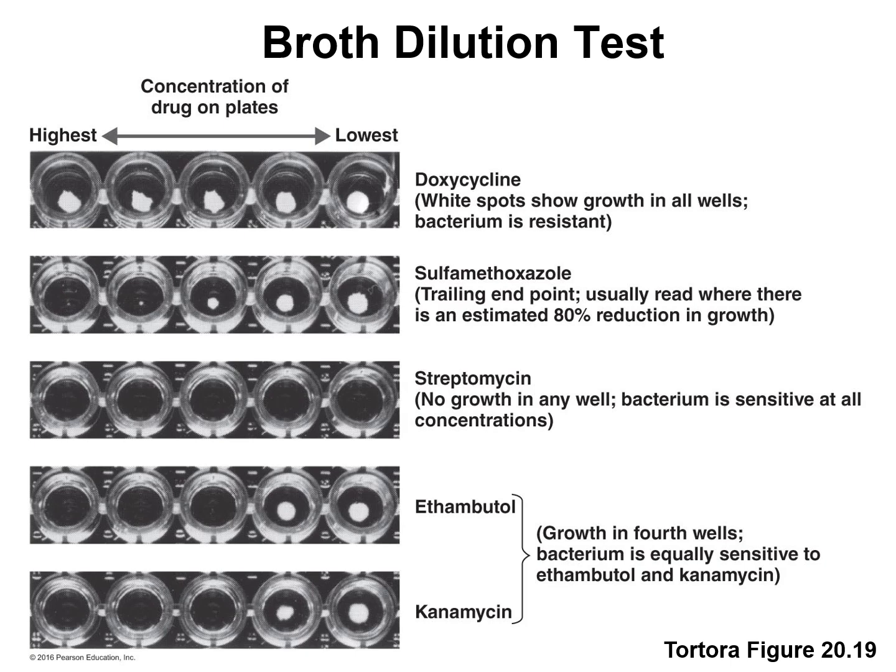And then the kanamycin and the ethambutol on the bottom here.